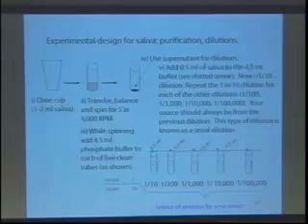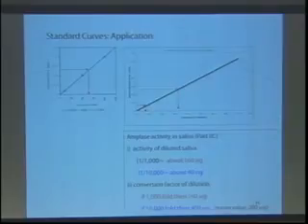Now, this experiment is identical to part 1, except in part 1 you used a known amount of enzyme. So in this case, you can use it to figure out what the equivalent activity would have been, what it would correspond to. So you have a curve like this from part 1. Have you seen a standard curve like this before? Yes, the red dye was a standard curve. You figured out the concentration based on your OD. So the same thing's happening here. You have an OD, or micromoles maltose. You read over and down. Now that's the equivalent amylase activity.